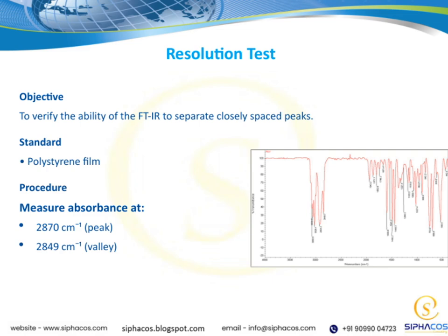Remember, the goal is to see if the instrument can distinguish between peaks that are very close in frequency, ensuring our analysis will be precise even with complex samples.